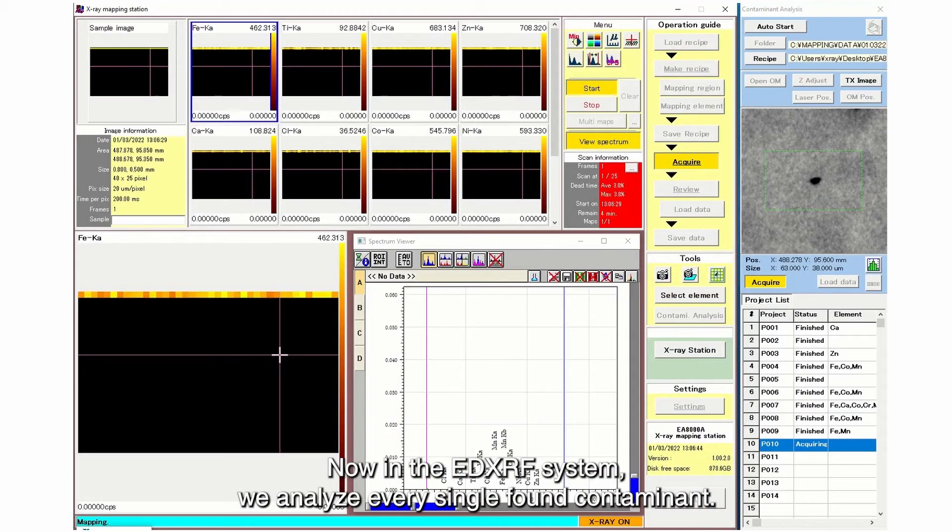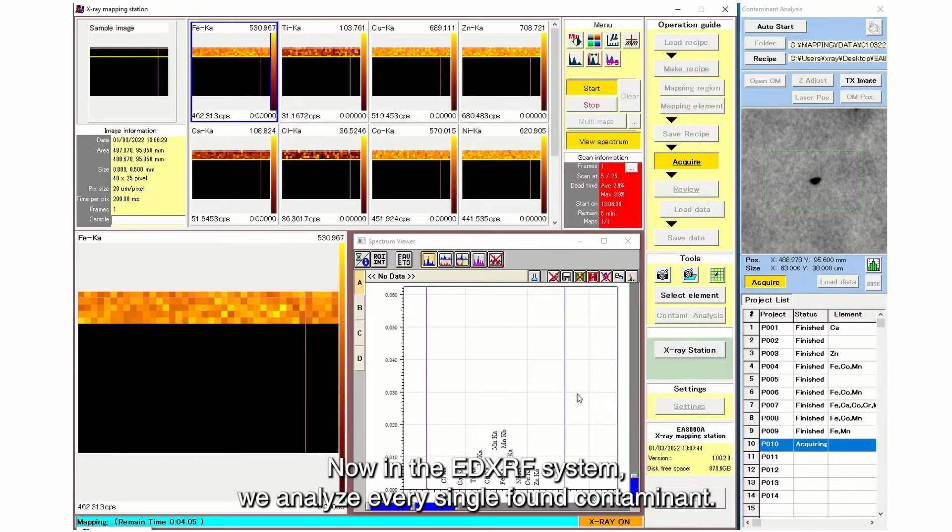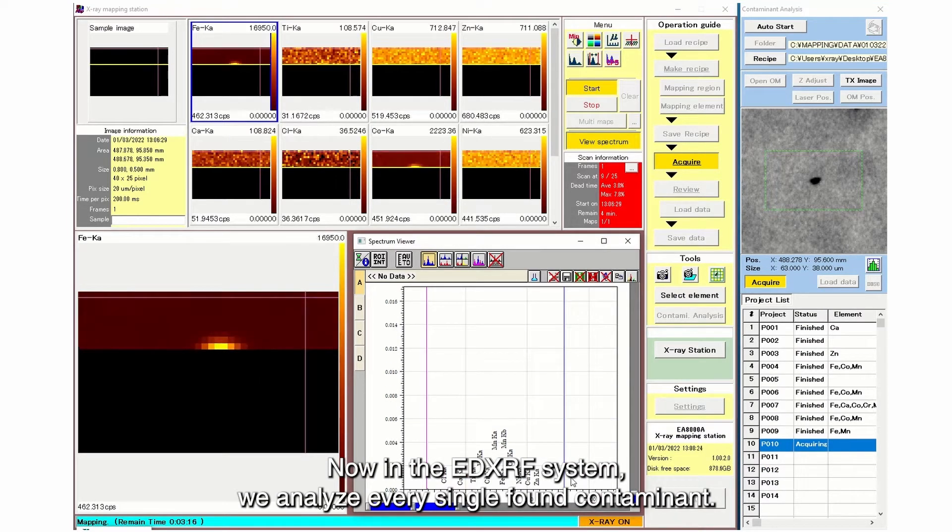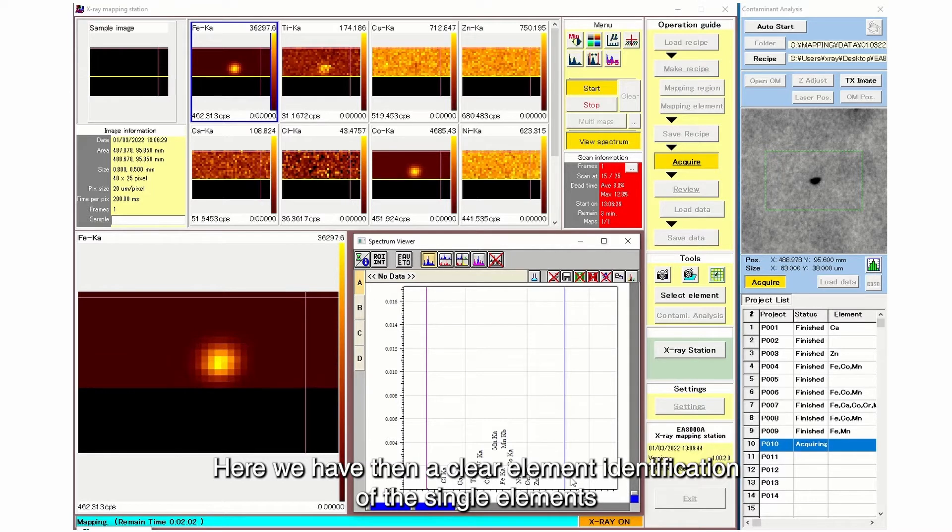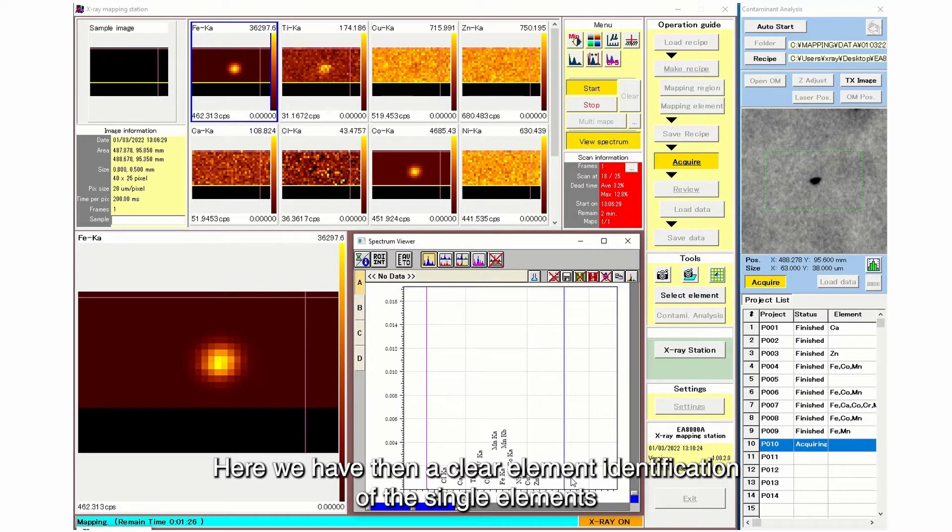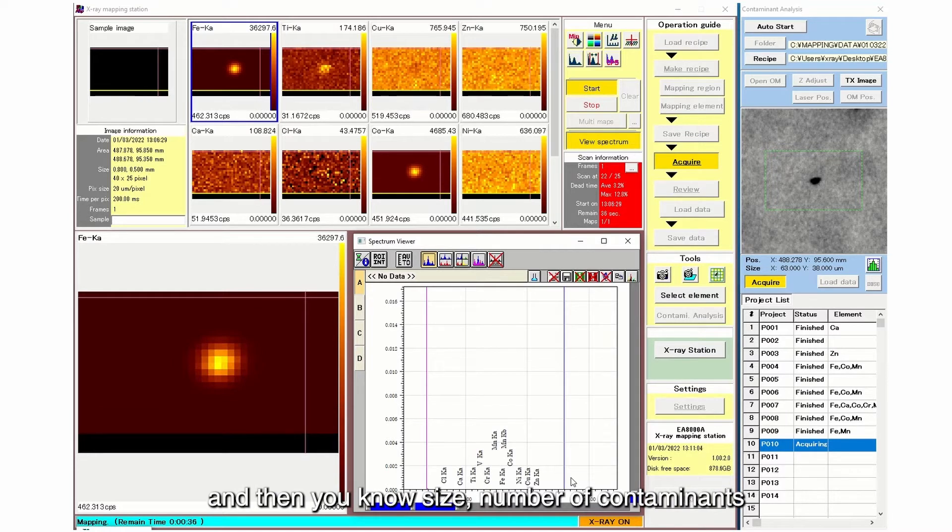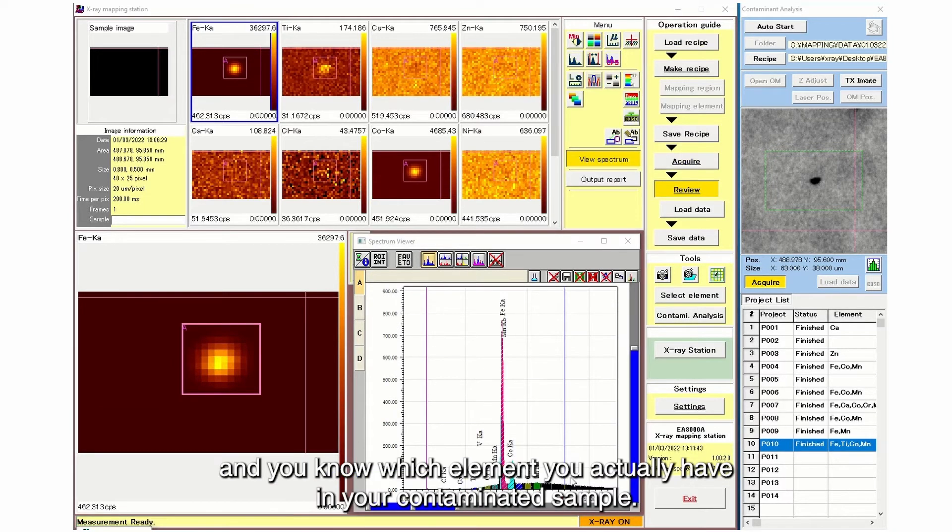Now in the EDXRF system we analyze every single found contaminant and here we have then a clear element identification of the single elements and then you know size, number of contaminants, and you know which element you actually have in your contaminated sample.